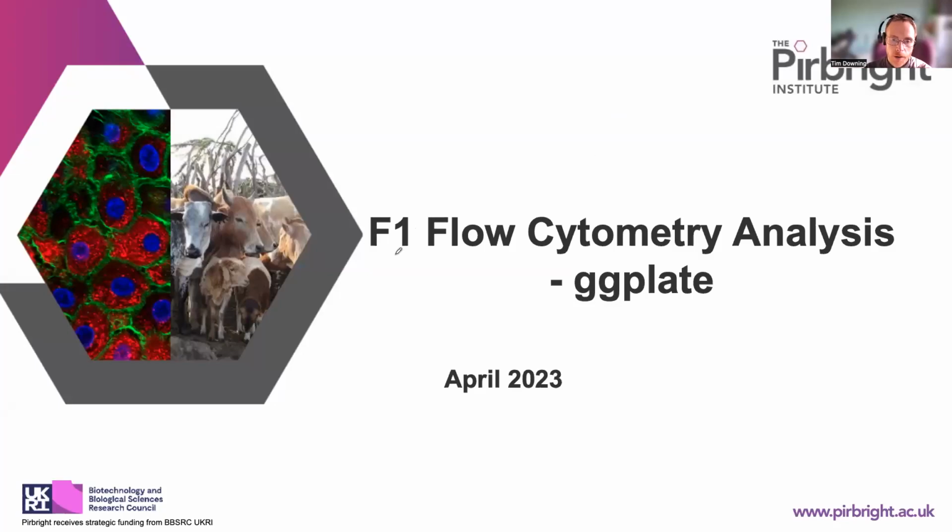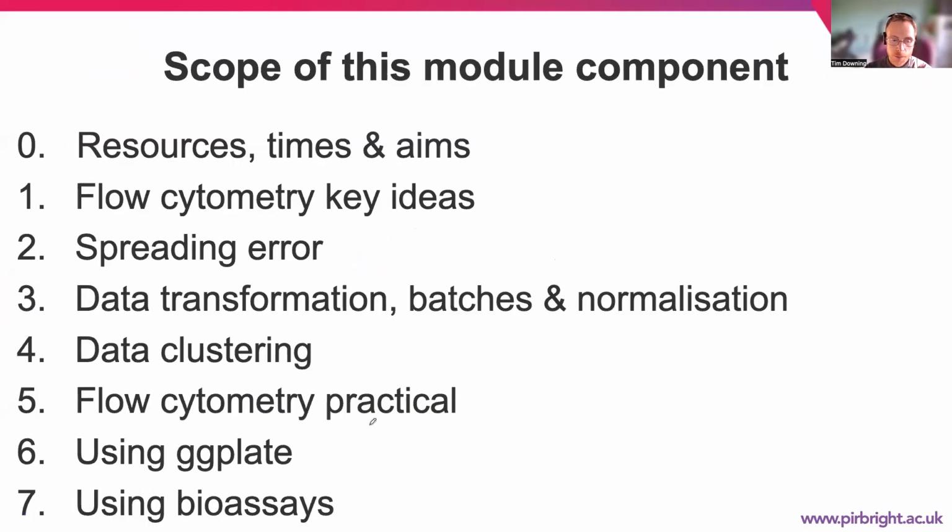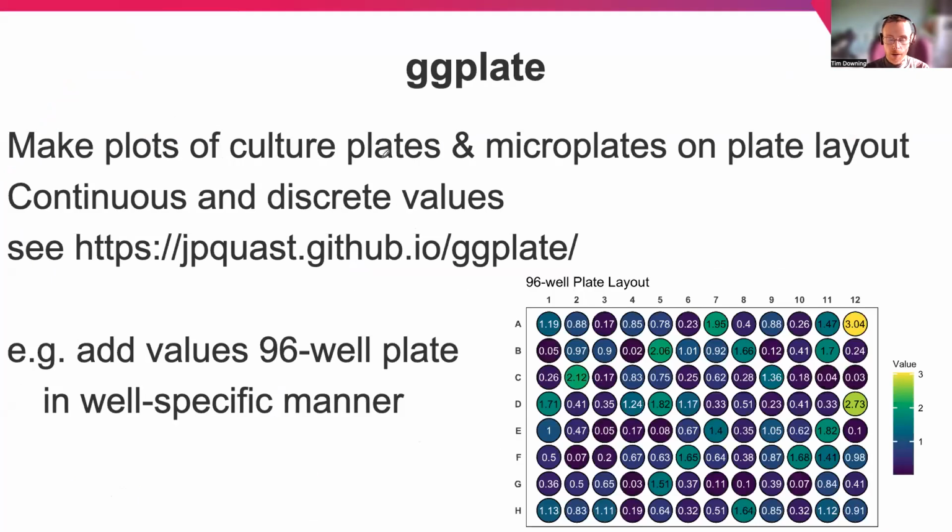So this part of the Flow Cytometry course is a demonstration video on our usage of this package called ggplate. So this kind of forms this part of the course. It's mainly just looking at how we can import data in CSV format and map that onto plates of different sizes.